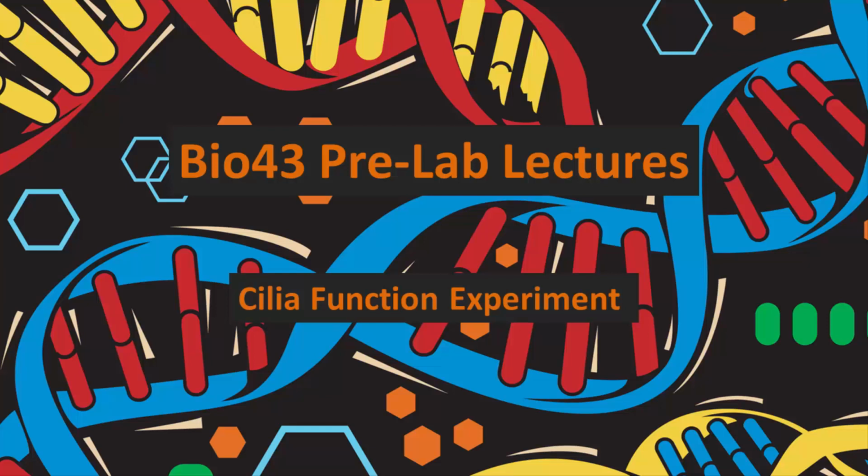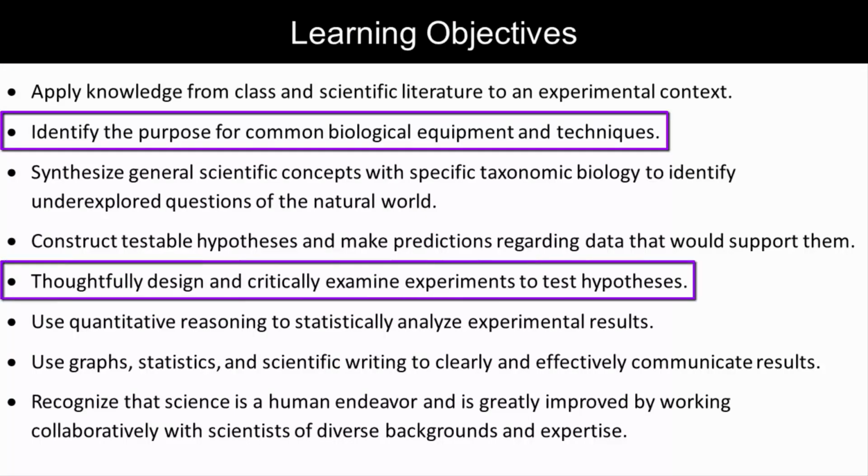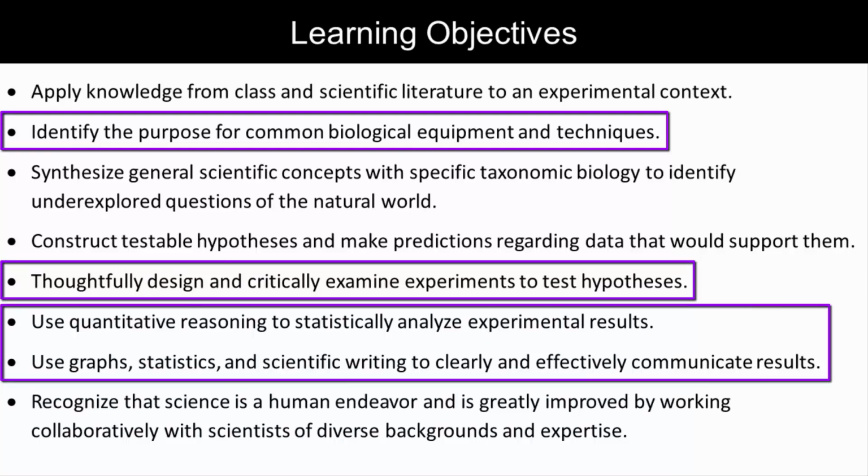This video will walk you through an experiment to measure cilia function. You'll see an application for common biological equipment and techniques, learn about a technique you could apply when designing your own experiment, and later use this data to practice graphing and statistical analysis.